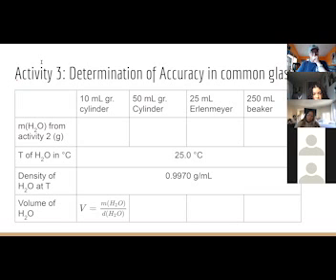You're probably going to have to look up the density because this is Carolina Scientific. They're in North Carolina. They're probably not used to days of 15 degrees outside or in your house. It's always warmer there. So we're probably going to have to look up the density of water, and then you're going to calculate the volumes.